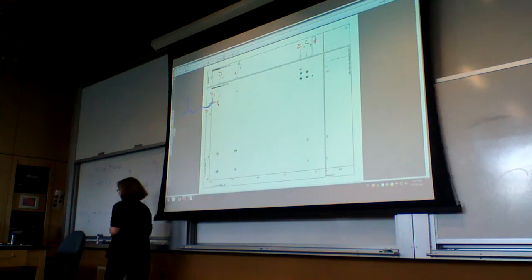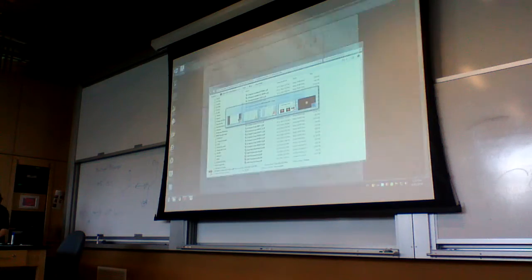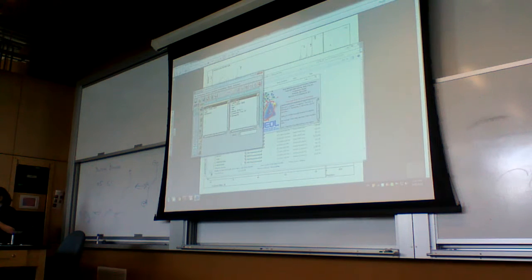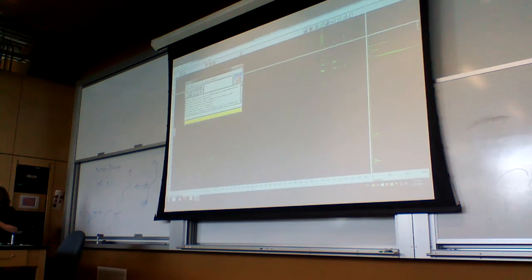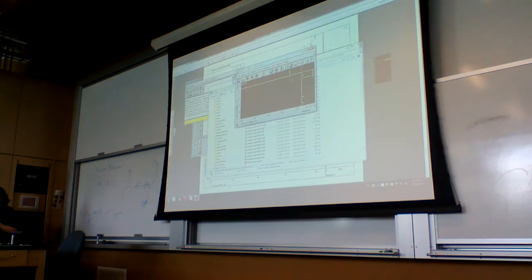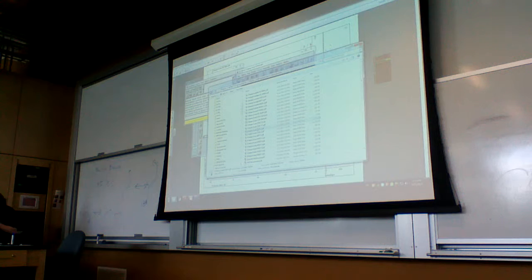For the other ones, I'm going to open up the Delta version, because when we're looking at these cross peaks, you need either a ruler or some way to define what you're doing. Now when you open this up in Delta, they still have a system. Let's see how far we can get.